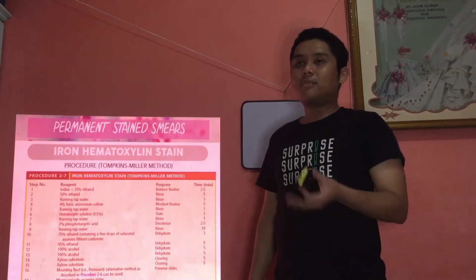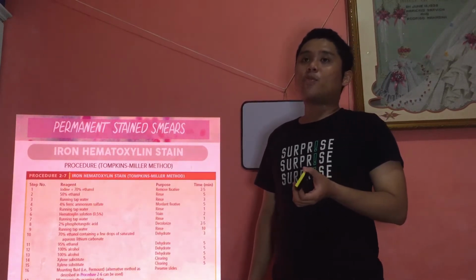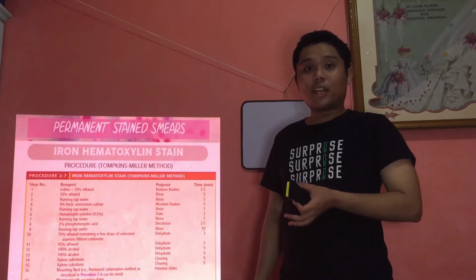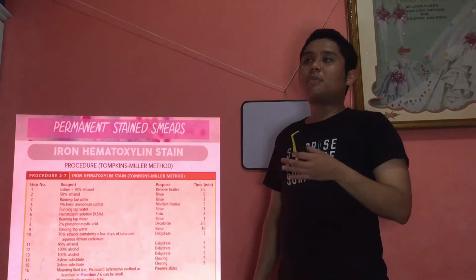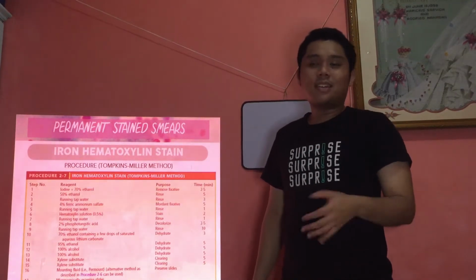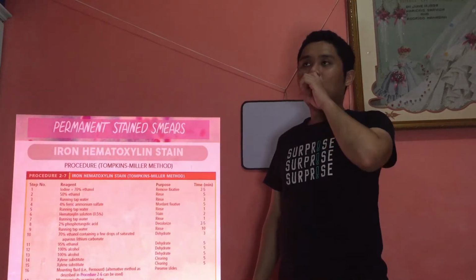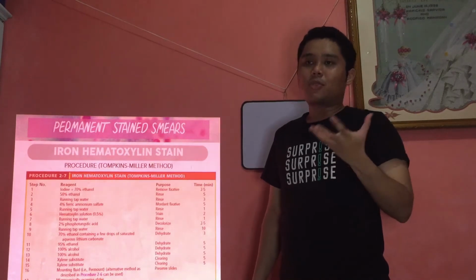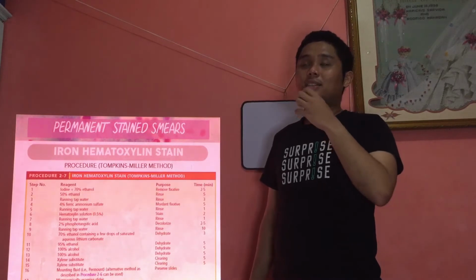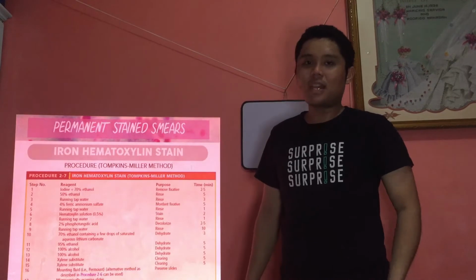Why? Because xylene in itself is carcinogenic, okay, and it's really harmful to the health of laboratory technicians. So for those who are working in the histopathology section of the laboratory, histotech, they're very much prone to carcinogenic materials like benzene, xylene, different alcohols, so it could be really hazardous. So you are exposed to a lot of chemicals, reagents in tissue processing if you are assigned in histopathology subsection of the laboratory. So you have to be very careful. Okay, always wear your PPE and all that.